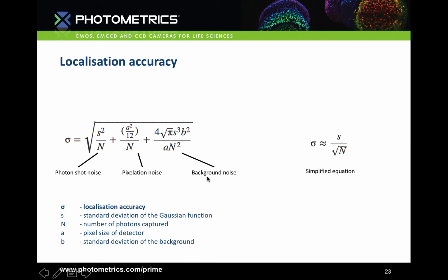Background fluorescence is noise from all other sources, including camera noise, scattered light, non-specific labeling, autofluorescence, and other sources of noise produced by the sample. This is typically corrected by diligent sample preparation and choosing a camera with low noise characteristics.